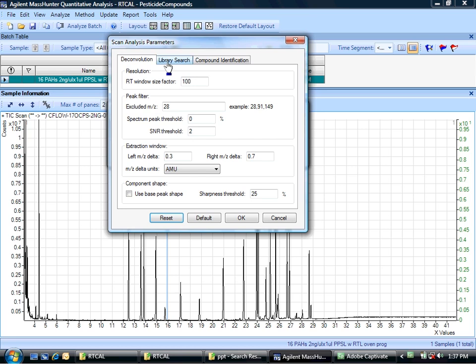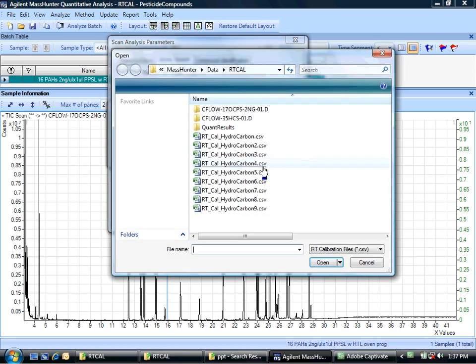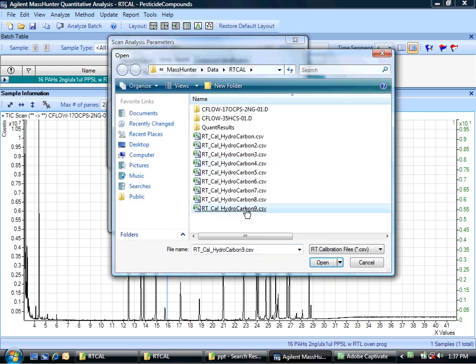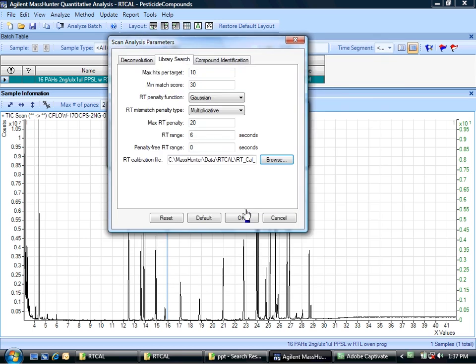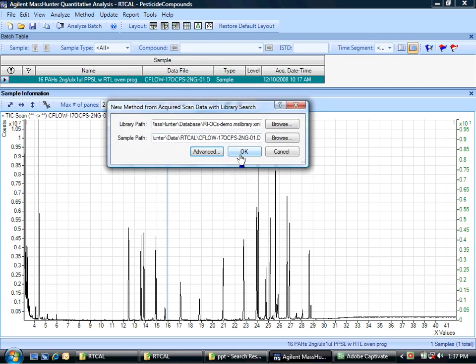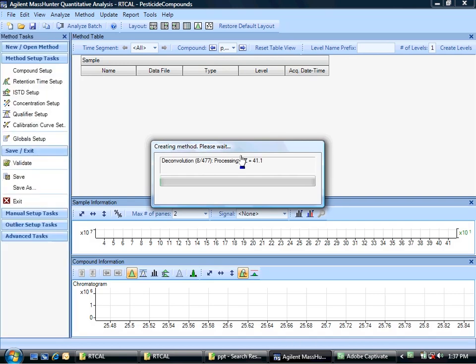And I'm going to go to the advanced here. And as I look through in the library search tab, I need to make sure that it's pointing to the retention time calibration file that I've created. So in that case, it's my last try, which is nine, and I'm going to let it fire off.